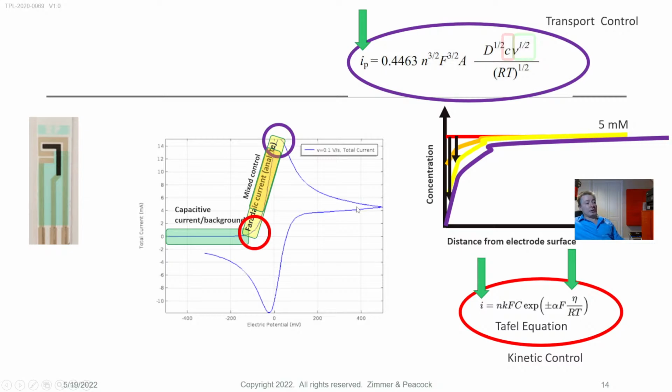So cyclic voltammetry has a definite shape. I think people think it's very important that it has this shape. Whether it's important or not, from a biosensor perspective, as long as your signal is proportional to concentration, that's what's important. Whether you have an ideal shape is not necessarily so important. But I do now want to explain why, if you read any electrochemical paper, they often say my current was proportional to the square root of my scan rate. Where does this actually come from? So I'll try and explain that now.